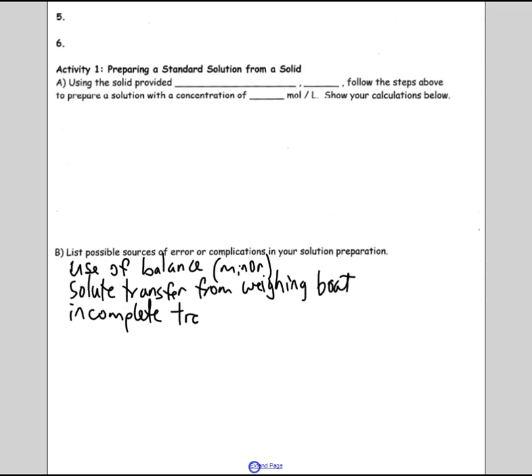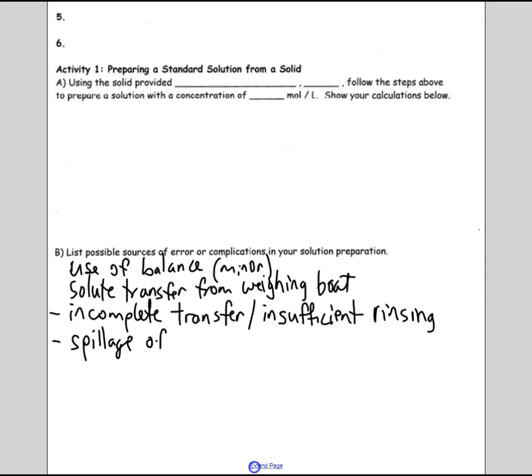Incomplete transfer, which would be a result of insufficient rinse step or rinsing. We could have spillage occurring at any of these steps. So spillage of solution.